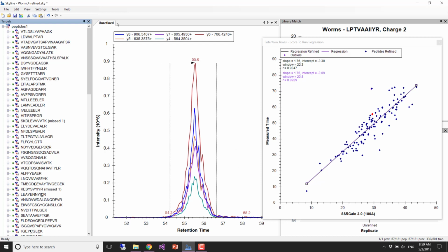That's because I noticed you have two tabs. So you missed the step where you were supposed to remove. I have one tab unrefined, but I would just say use the unrefined replicate. You get to choose a replicate.